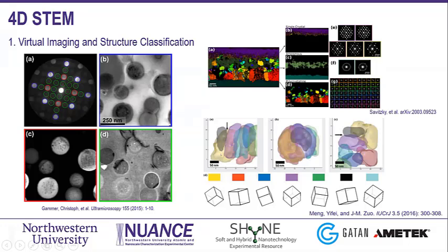There are other works that started before, using CCDs, that were not branded as 4D STEM. So you can search for scanning diffraction, nano beam electron diffraction, and I guess nano beam scanning diffraction too. There is a bunch of nomenclature that people have used before for these STEM techniques that basically do similar work using diffraction patterns and really lay the foundation for analysis in 4D STEM.